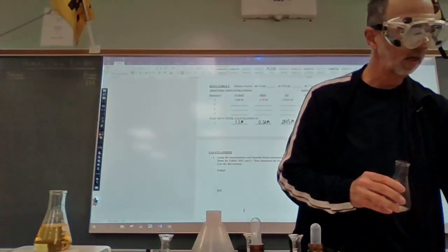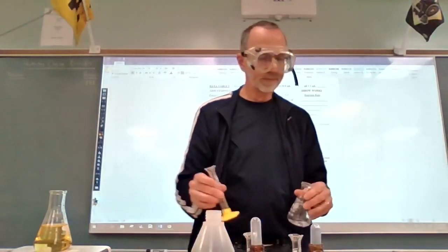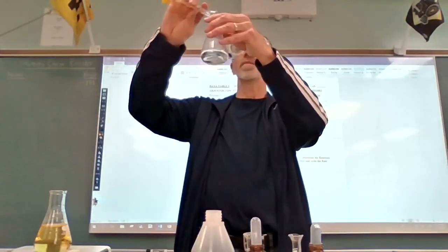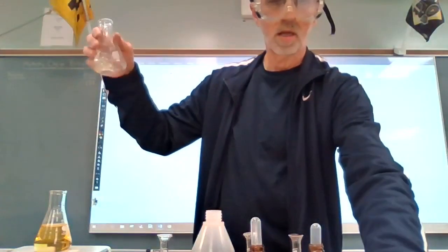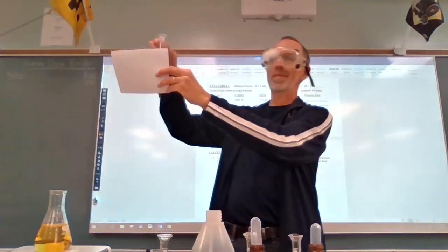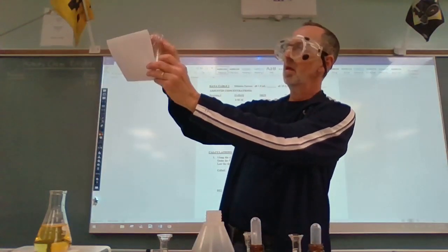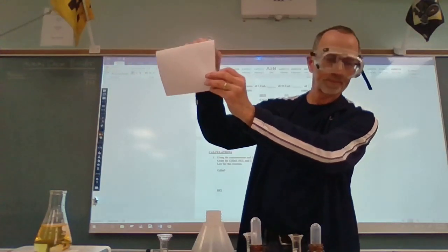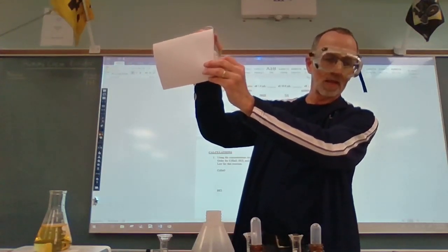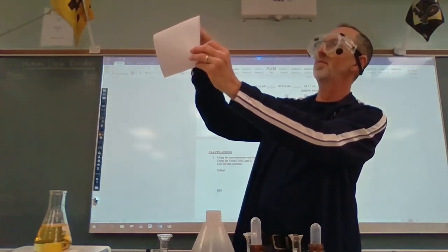Phone reset here. Okay. All right. Here we go. A little bit longer delay there. I'm getting slower. All right. And it's starting to fade.